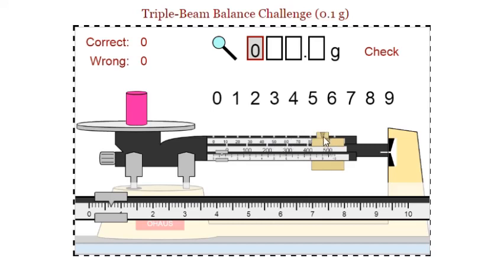Now I have to look at my front rider. Notice these are now in increments of 1 gram: 1 gram, 2 grams, 3 grams, 4 grams, 5 grams, etc. Right now my little arrow here is pointed somewhere between 0 grams and 1 gram. So I know with a fair amount of confidence that my mass is 590 grams, but it's not exactly 0 - it's more than 0 grams.